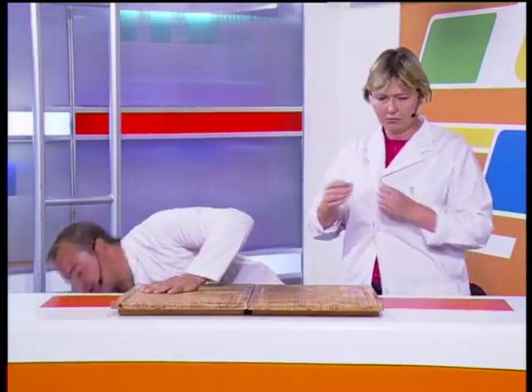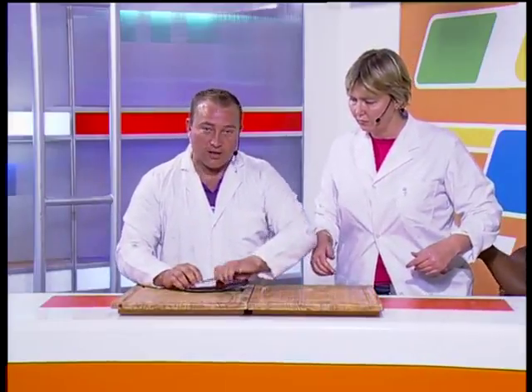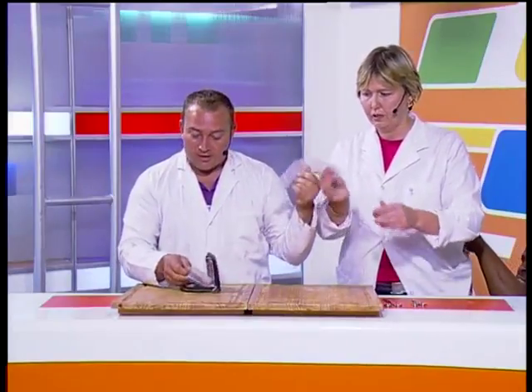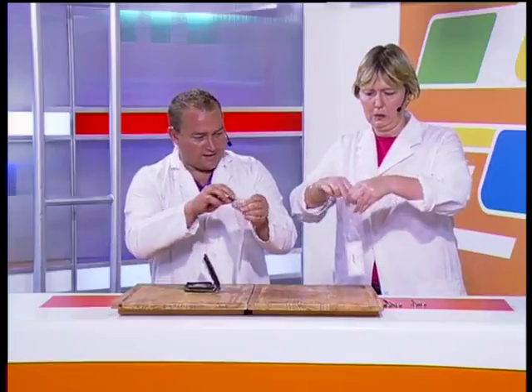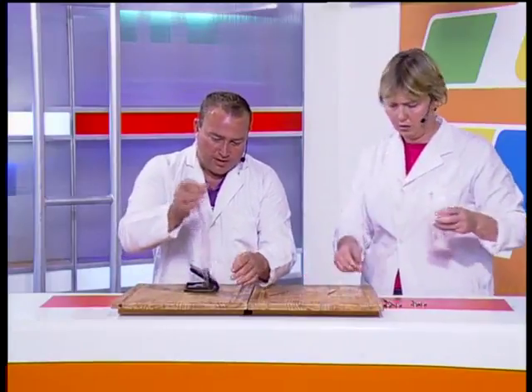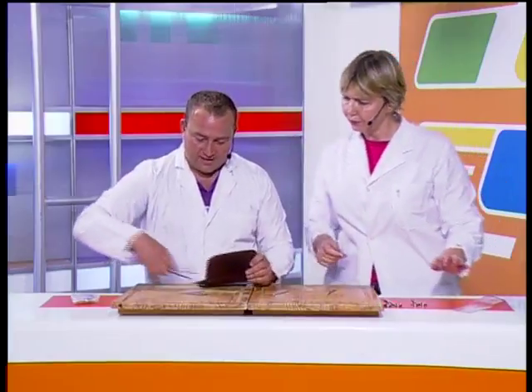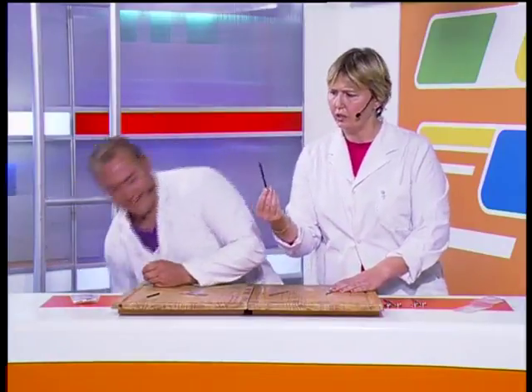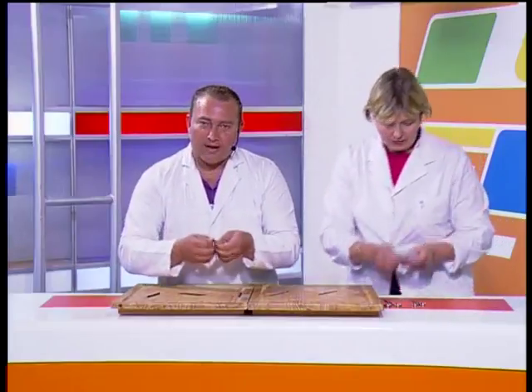Then we need to get our utensils out, just to make sure. I've made sure that I did everything. I left everything to last. So I've got scissors, and we've got scalpels. These are brand new. Of course they're brand new. And inside, we've got the blades as well. So we've got a scalpel and 2 blades. And then, of course, I thought we'd better bring some pointers, just in case. These are dissection needles. Yes, but they're going to point today. Today they are pointing.